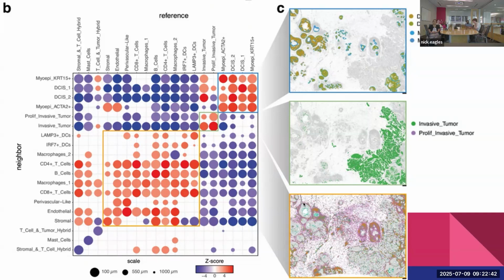So it's always good to check what these cell types actually look like spatially when you identify that they have this type of relationship based on the package. So this is a cool example just to mix real cell types in a cancer data set.